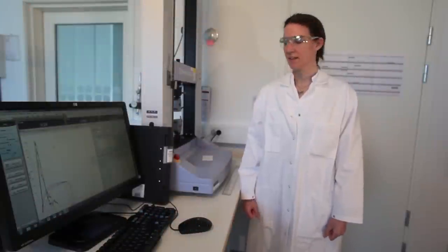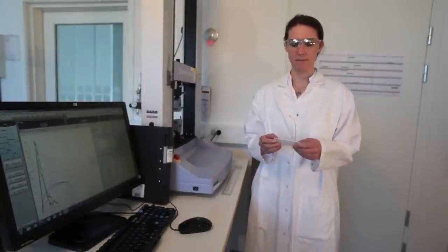Welcome to the Tensile Testing Room. Today we're going to pull apart some plastic material, which is from Contemporary Artworks.